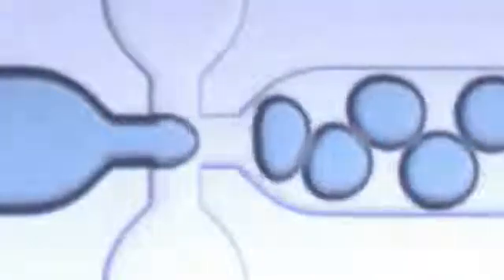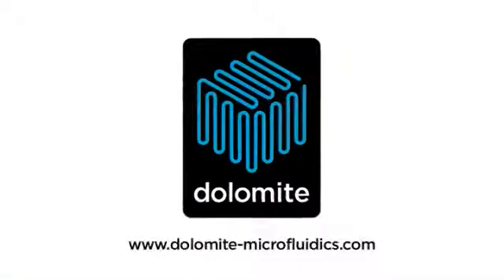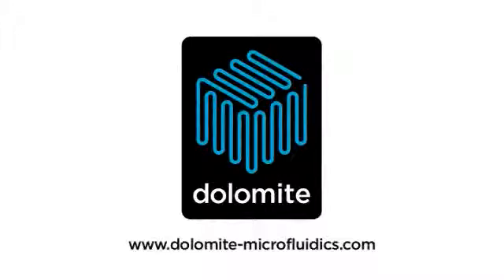By varying the water flow rate or chip design it is possible to adjust the droplet size. Contact Dolomite if you would like us to help you set up your system.